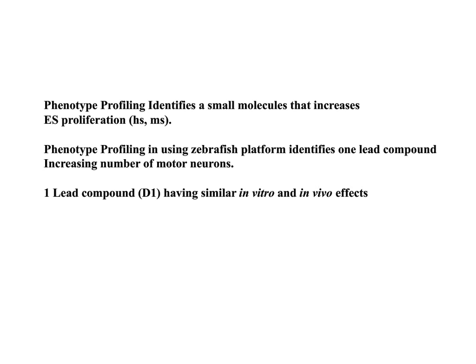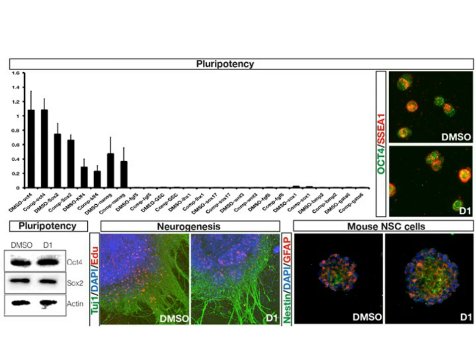And we saw no such effect. qPCR, immunostaining, and even differentiation did not show any effect on pluripotency. We also saw no effect on apoptosis.